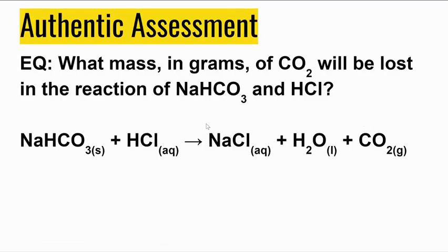So your essential question is: what mass in grams of carbon dioxide will be lost in the reaction of baking soda with hydrochloric acid? And you can see we have our balanced reaction written out below. It's one we've used in several labs before.